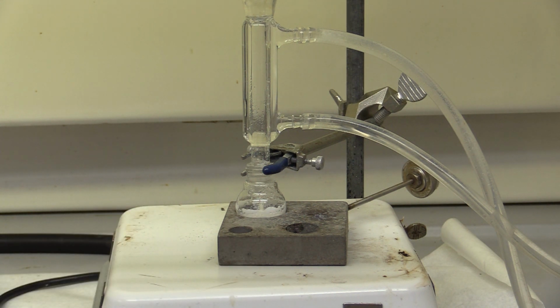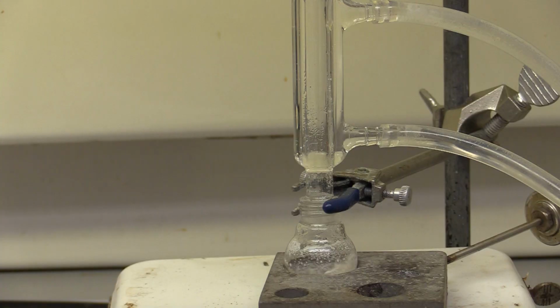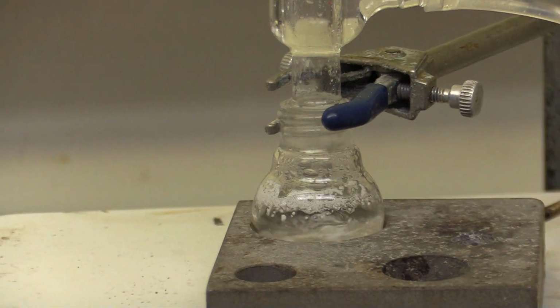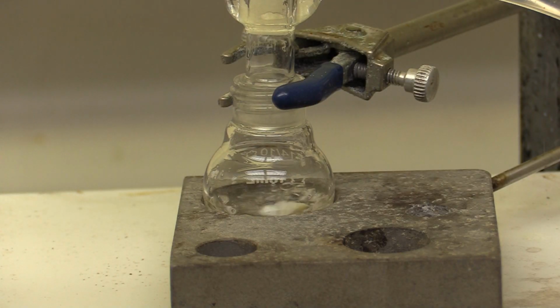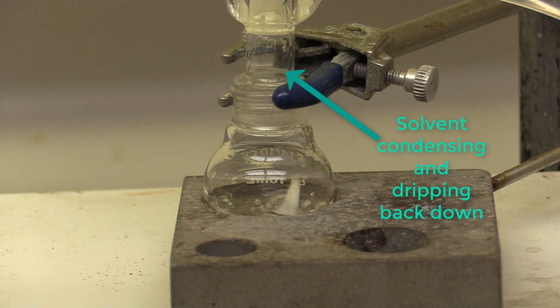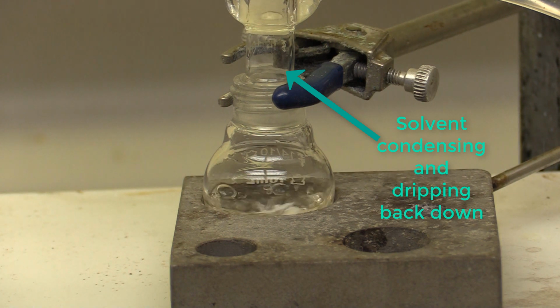Heat the reaction mixture under reflux for 30 minutes. Reflux time should begin when you can see bubbles in the reaction mixture, showing that it is boiling. If you cannot tell if it is boiling or you can't see bubbles, turn the stirring off so that you can see the bubbles. If after 30 minutes the mixture still smells like wintergreen or looks oily on top, heat it for a longer period of time.